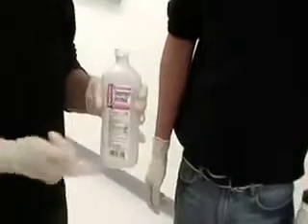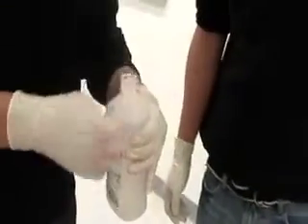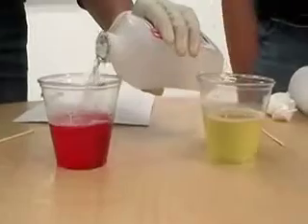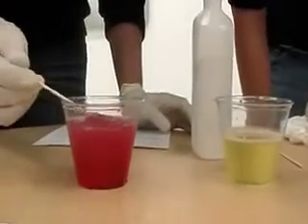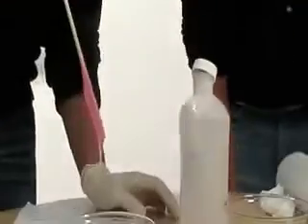Now in the final step, you're going to actually precipitate the DNA out of solution, and you'll do this by using ice cold rubbing alcohol. And so what I'm going to do is just approximate an equal volume of alcohol to add to my soupy mixture here, and use a popsicle stick and look at all this goopy DNA.